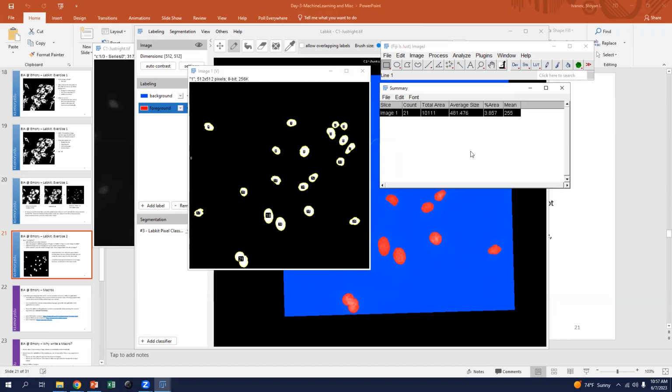So this is something to keep in mind. When you have a trained classifier you're applying to images, it will classify them the same way every time. It's very consistent. If it's trained by different people who haven't compared their annotations, then it can produce different results, but it will produce different results consistently. So it's just something to keep in mind.